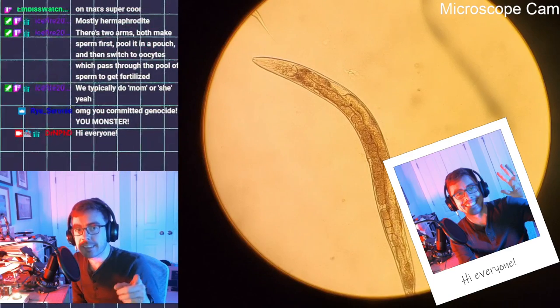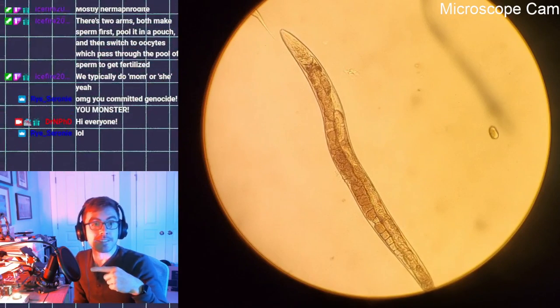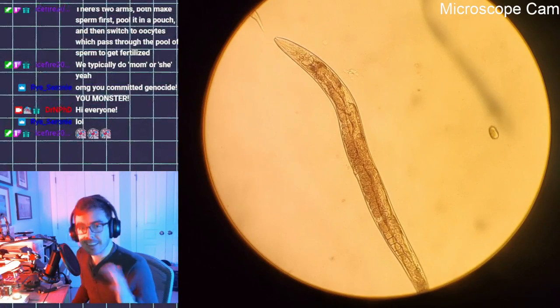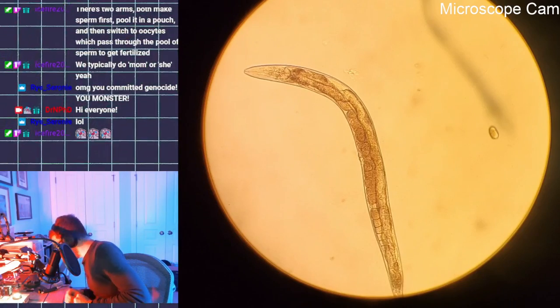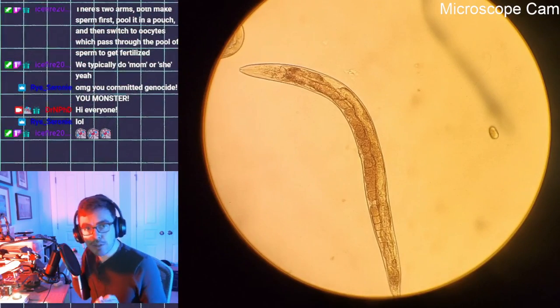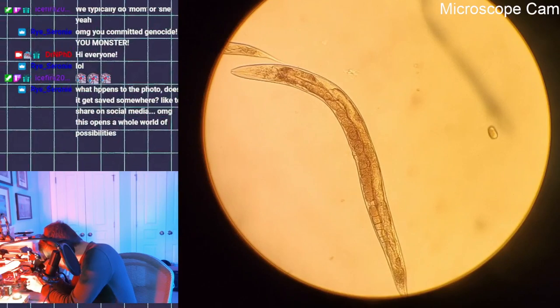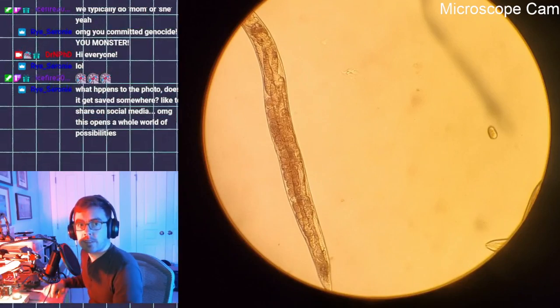So I want to do that. Is it going to go away? Yeah. So I want that, but I want that to work for the microscope, right? I'm just doing a couple tweaks. So right now it just does it for my camera, which is cool, but not exactly what I want quite yet. Okay. Levamisole. Where is my levamisole? There you are. I also need to add some sort of sound to it so I'm not looking away the entire time. Okay, I added in the paralytic.